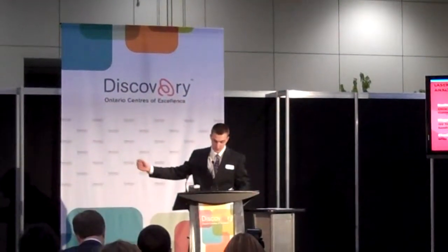Our presentation today outlines the analysis of oil samples with laser-induced breakdown spectroscopy. The main objective of this project is to create a device for testing impurities in oil samples in industry that can be done on-site, rather than taking the oil samples to a laboratory.